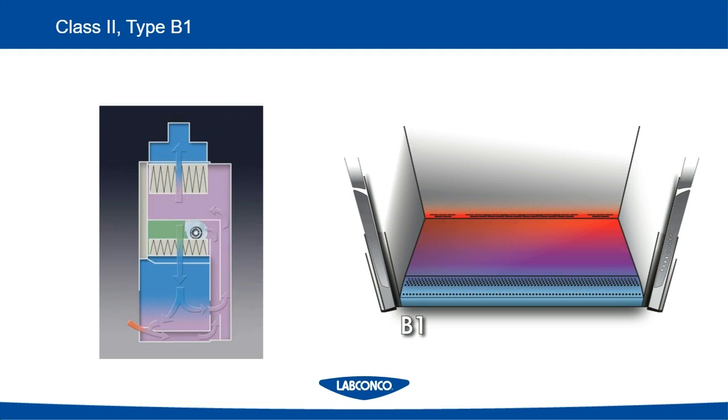From the side view, you can see a little bit about how this cabinet works. Inflow air still comes in the front, as denoted by the orange arrow, and the air passes underneath the work surface. However, you notice in the back, there's a little bit of a split plenum. So depending on where the airflow is coming from, the front or the back, determines if it takes the exhaust pathway or if it's circulated back around into the supply pathway.